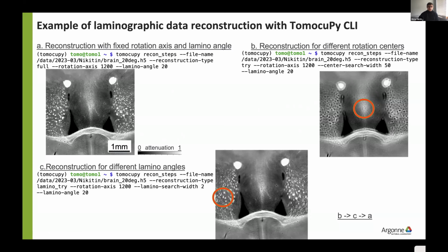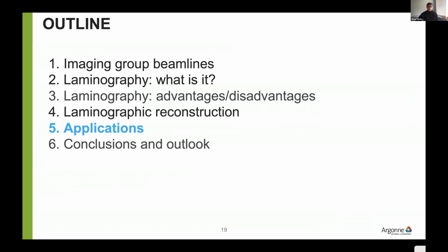Again, this reconstruction is really fast. It is implemented on GPU. It is much faster than data collection. Okay, now we will talk about applications, probably the most interesting part here.